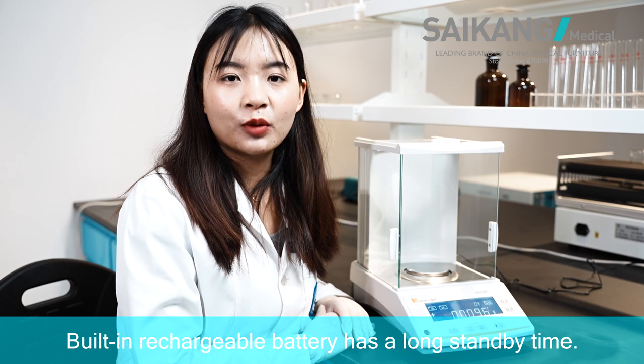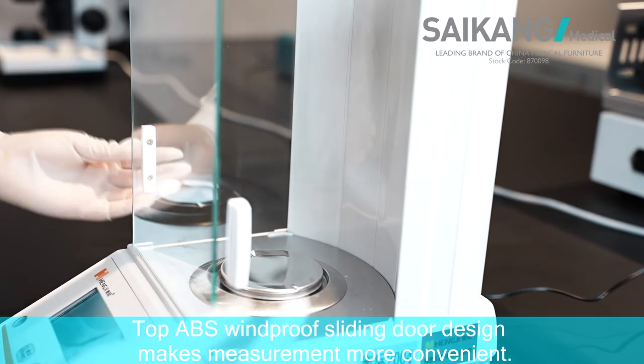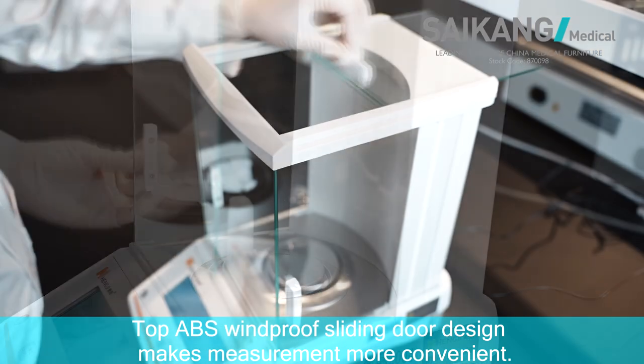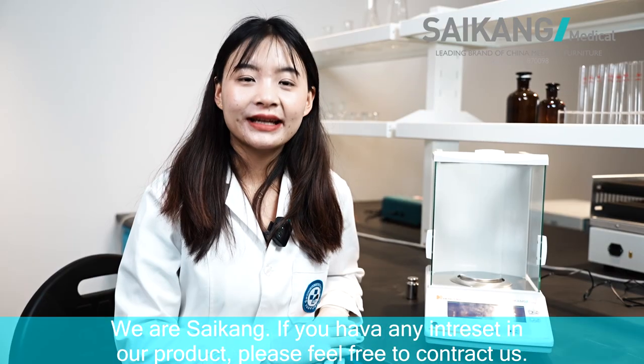Using rechargeable battery has a long standby time. Top ABS windproof sliding door design makes measurement more convenient. We are Saikon.